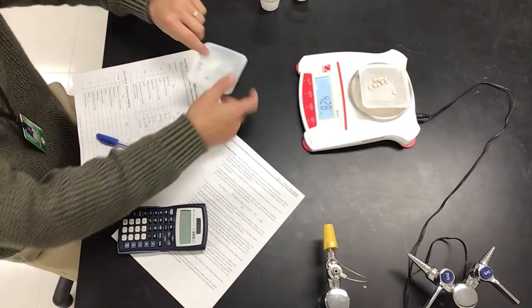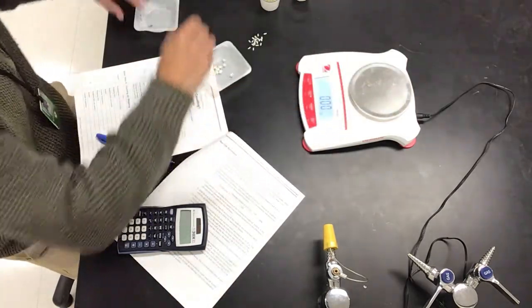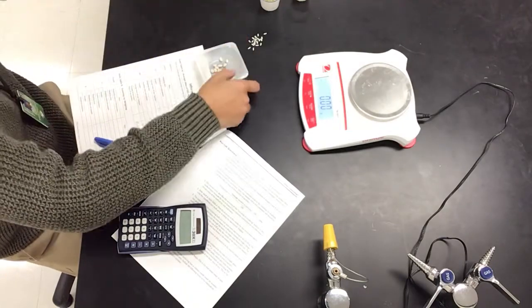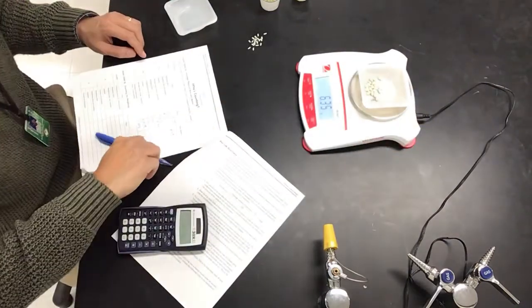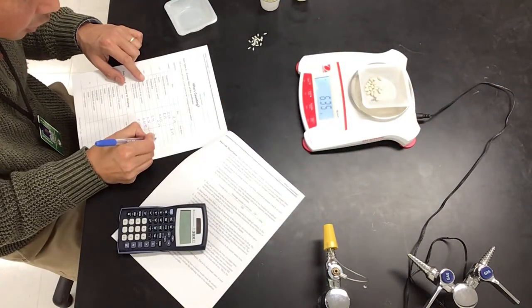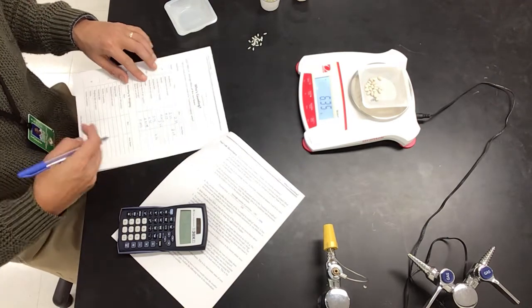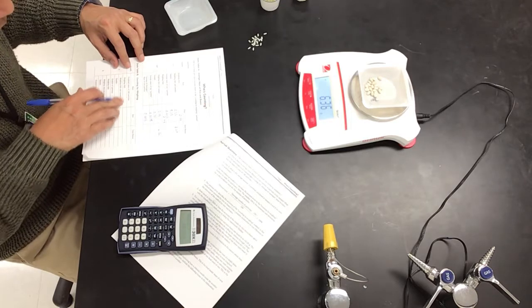For the 20, I'm going to pour all of them in here. There's the 10 here, and then 20. For the 20, the mass is 6.36. You're going to fill in the other one. Okay, fill it in. And then at the bottom, you're going to predict the mass of 100 particles for rice and bean.